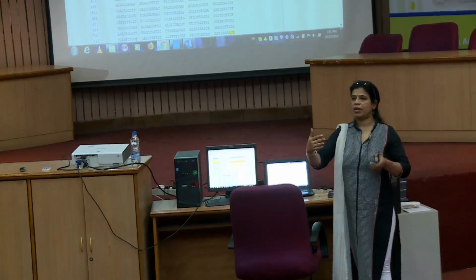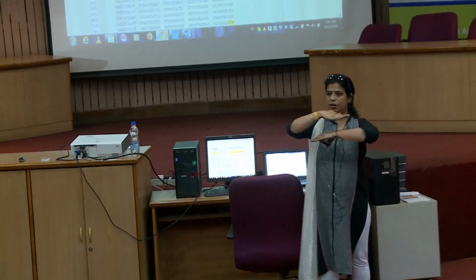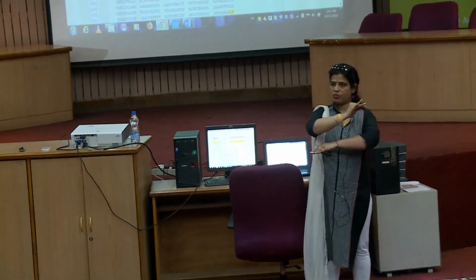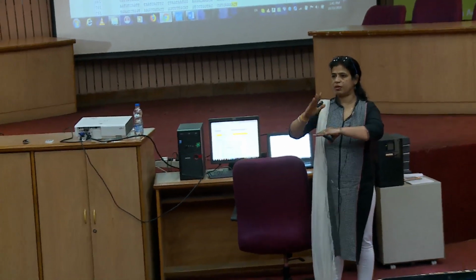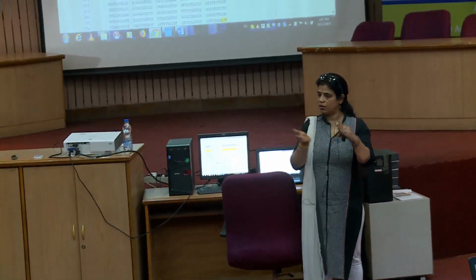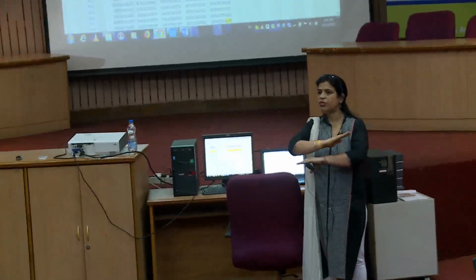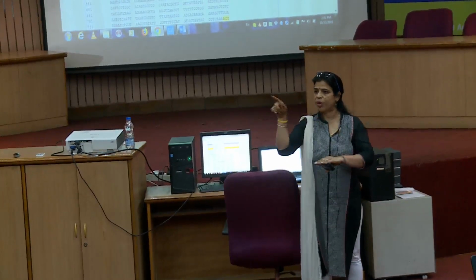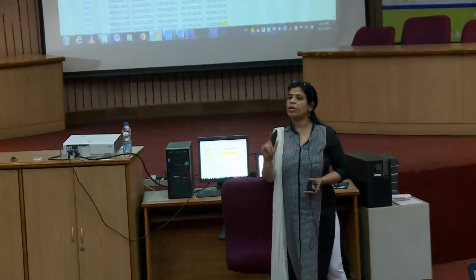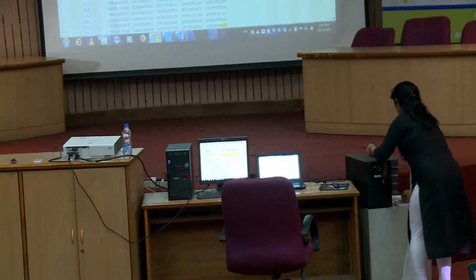Let us suppose you have a template; the things are double stranded only. Your primer is designed, forward somewhere here, reverse somewhere here. Both the strands are reverse complementary of each other, correct? One is 5 prime to 3 prime, another is 3 prime to 5 prime. So the primer should also be in that orientation only. I will just show you how it works.